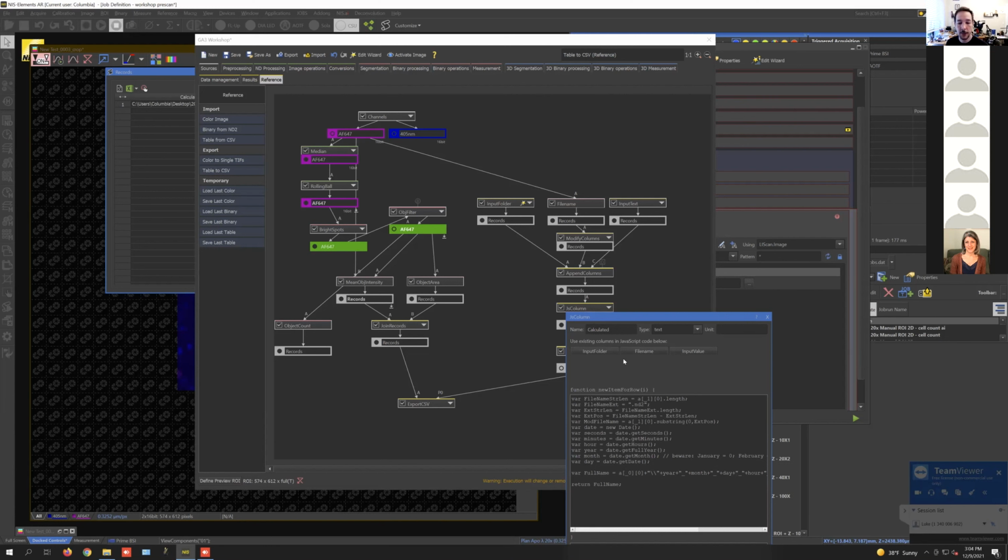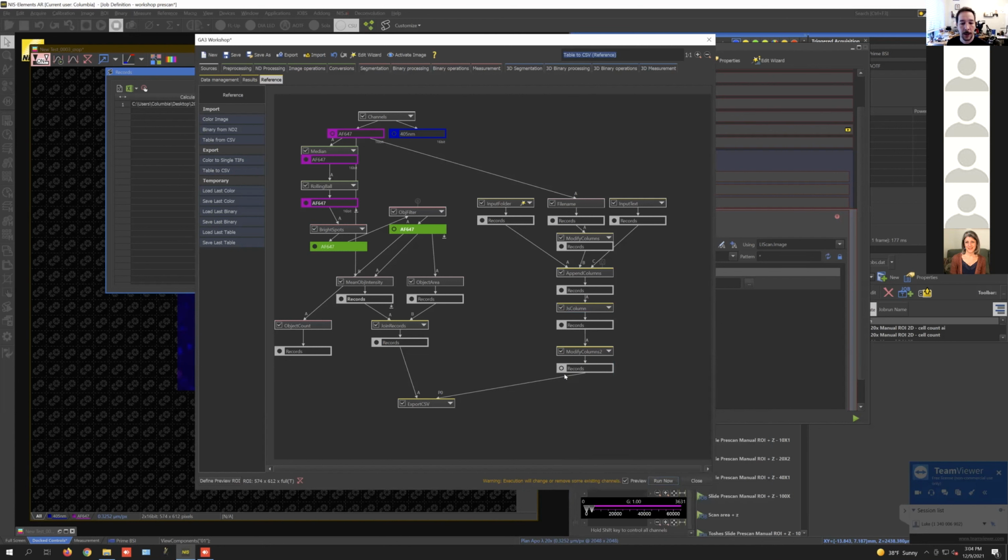So in any case, if you're using this, let us know and we'll add this in for you. What this means is when we run the job, you'll get a file in the folder saying how many cells were in each image. That way you can get an immediate analysis done. And I can run this on the fly for you now.